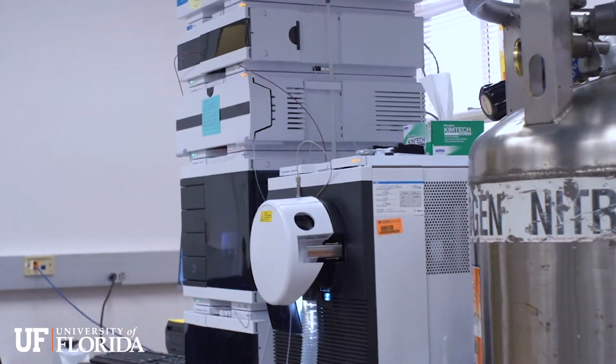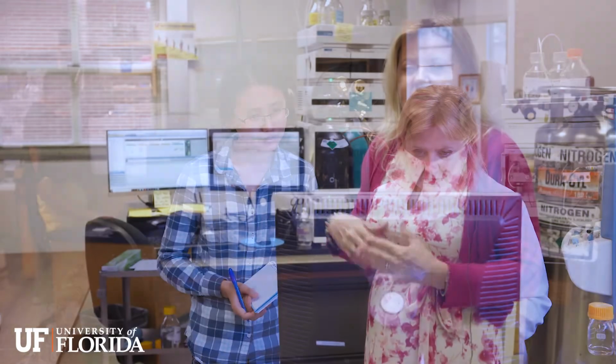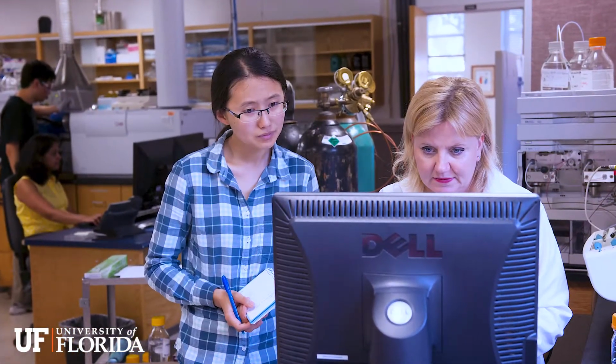And finally, here we have an LCMS quadrupole instrument. This is a very simple, low-resolution instrument, but it works beautifully. And again, we do this a lot for targeted type of analyses where we know what we're looking for. We just need to validate that it's there, or we're trying to quantitate how much of that particular analyte is in a sample. This has no MSMS capabilities, but there are many projects that this is quite applicable for.